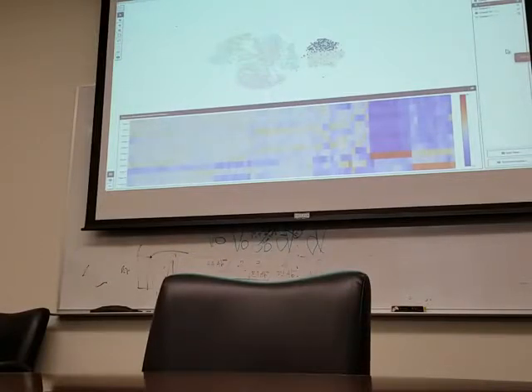That's what we asked the guy. I guess the way you'd have to do it is just export those cells, go back to the input file, eliminate them, and redo this. That would be very good to do. I'd be all in favor of that. Nobody seems to be able to do that yet. That should be capable of doing it in like Seurat or something like that. We should be able to do it. Can you do that? Just do it manually.